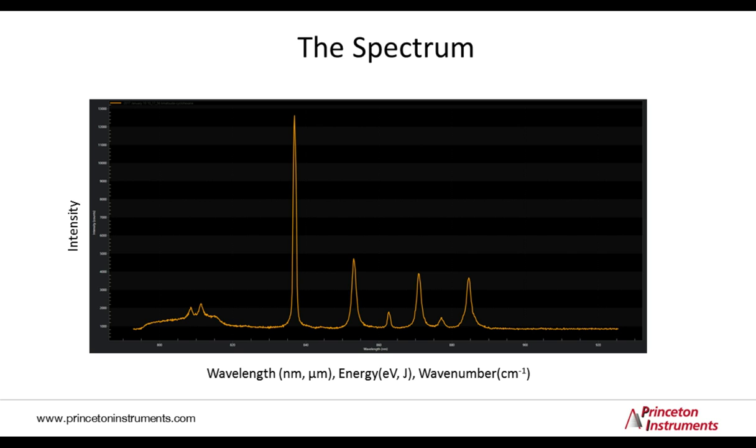Spectra have continuous or sharp spectral features or spectral lines, and once the spectrum is acquired, the task is to analyze what the position, height, or width of these features are to extract information from them.